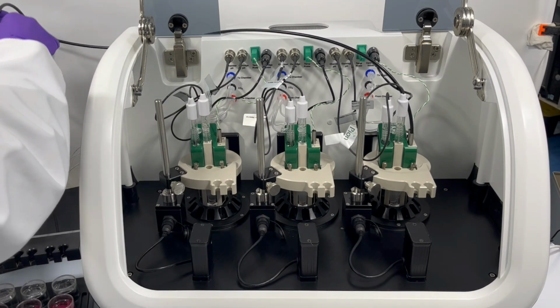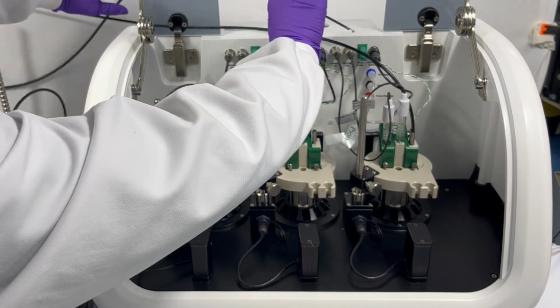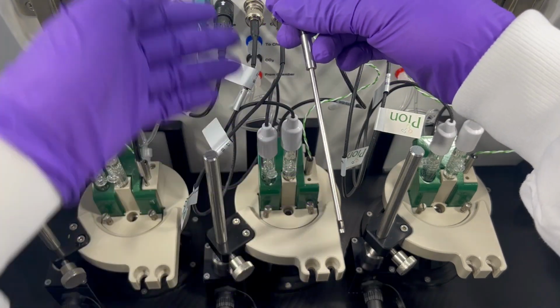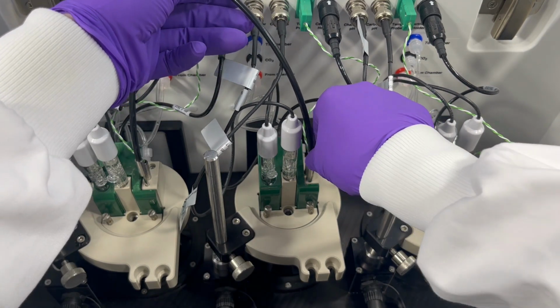And these are slightly smaller in diameter than the standard probes that come with the R6, and these fit inside the SCISSOR platform. And these are fixed path length tip probes with 10mm path lengths.